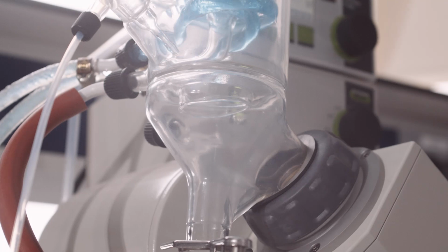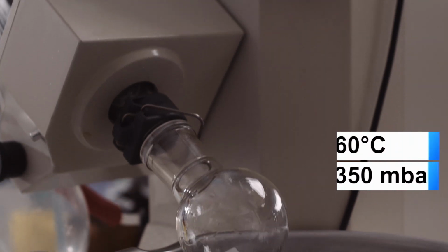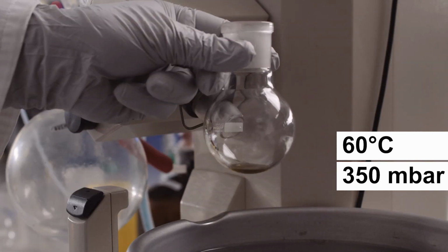The vacuum and temperatures we use depend on the solvent we want to remove. In our case, the conditions are 60 degrees Celsius and 350 millibars.